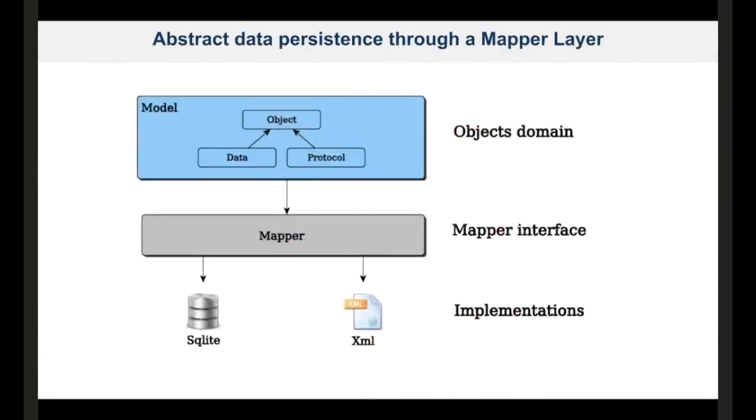Also, in the implementation, we try not to couple the design of this data model to the persistence mechanism. So now we are using a file-oriented database, SQLite, but this is transparent for a developer of a given protocol. So if you are a developer, we try to have the developer focus more on the computing task in the program that they are trying to wrap, and not need to deal with databases or queries. This layer, which we call the mapper layer, will handle storing and retrieving data. And then you will iterate or use the objects in a more API fashion.